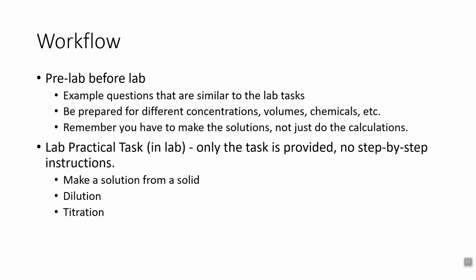So remember that you actually have to make the solution. So if you do on the lab practical and you calculate you need 0.504 grams in 100 milliliters of solution, think about how am I actually going to make that solution so that it's made properly. And if you're not sure how to do that, please come and ask us, and we are very happy to help.